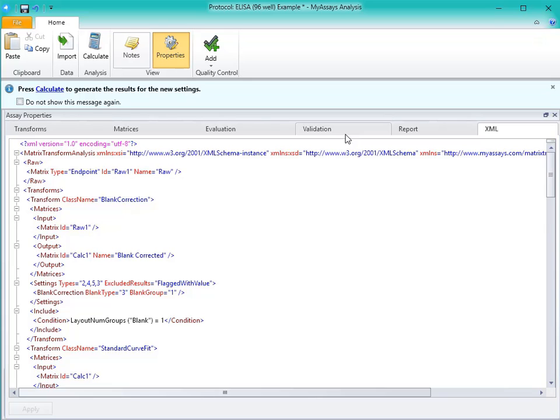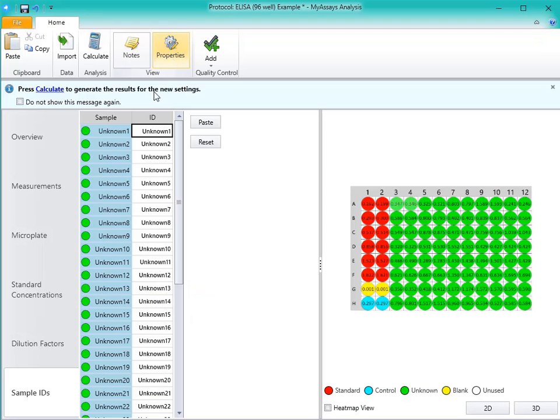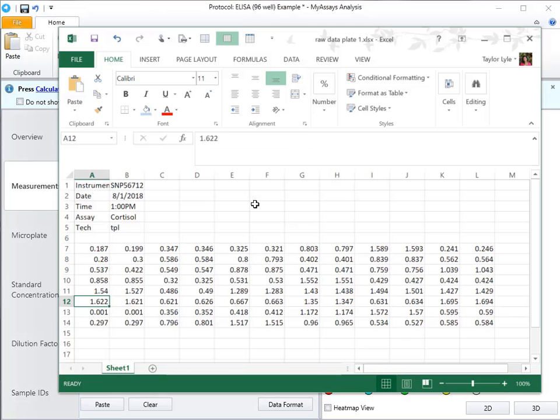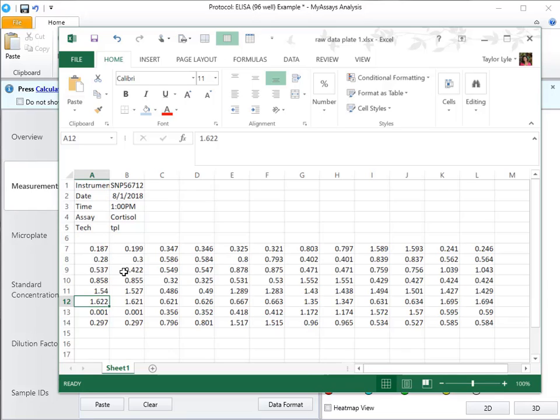Now let's use the ELISA protocol to import our data and calculate a report. First, I'll navigate to the Measurements tab. For this example, my data is contained in an Excel document. You can see that it's arranged in a 12 by 8 plate format with some associated metadata. I could just copy and paste my data into the pad, but instead I'll use the Import Wizard to import the metadata as well.